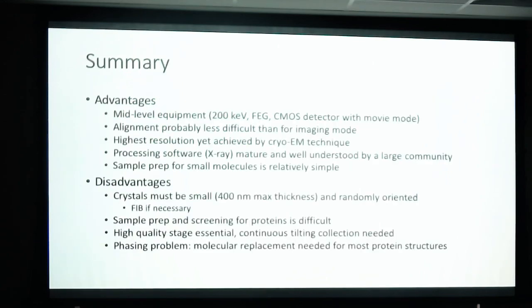So in summary, the advantages of microED are that you only need mid-level equipment, not the highest end. So a 200 kV microscope and a CMOS detector. The alignment is probably less difficult than for imaging mode. It's no longer dependent on everything being perfect. For small molecules, it does actually have the highest resolution yet achieved by any cryo-EM technique, sub-angstrom. Again, not a lot of papers of it, but still, it's kind of amazing. Since it's the standard X-ray processing software, it's pretty mature, and there's a large community of people who are using it. And the sample prep for small molecules is relatively simple, the powders.